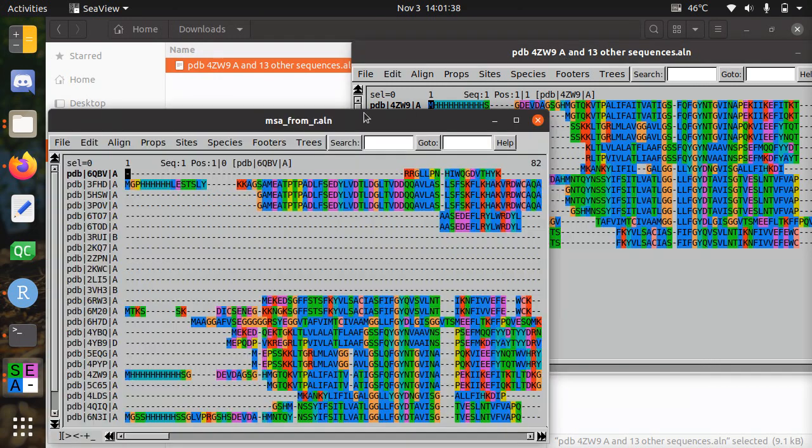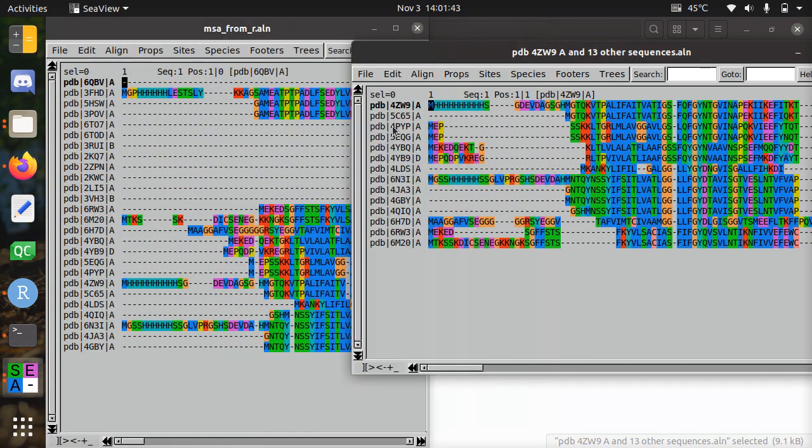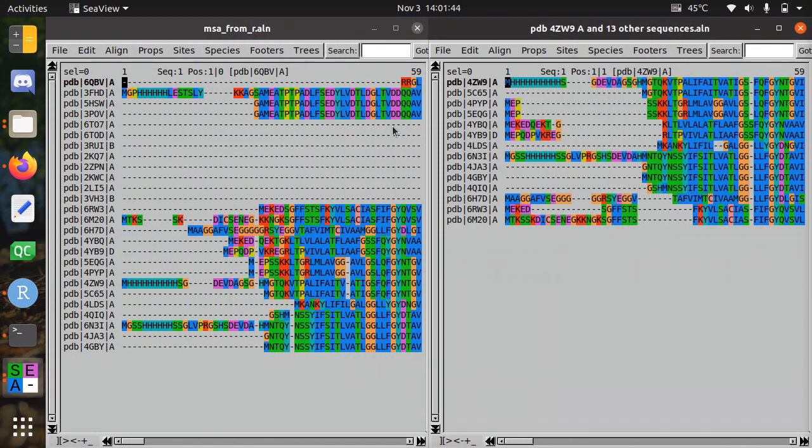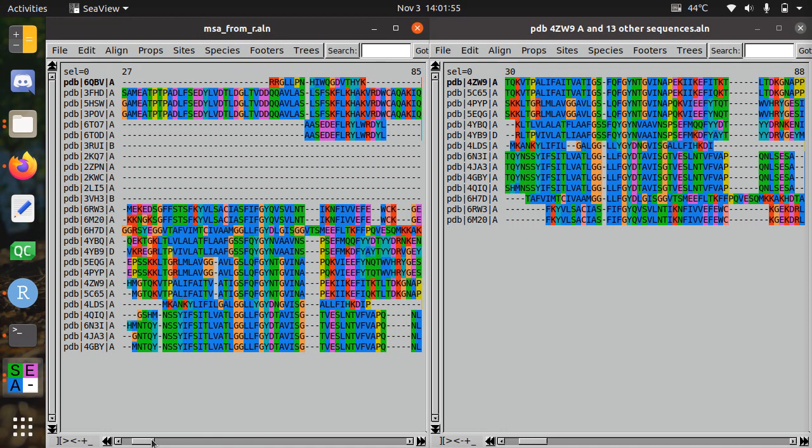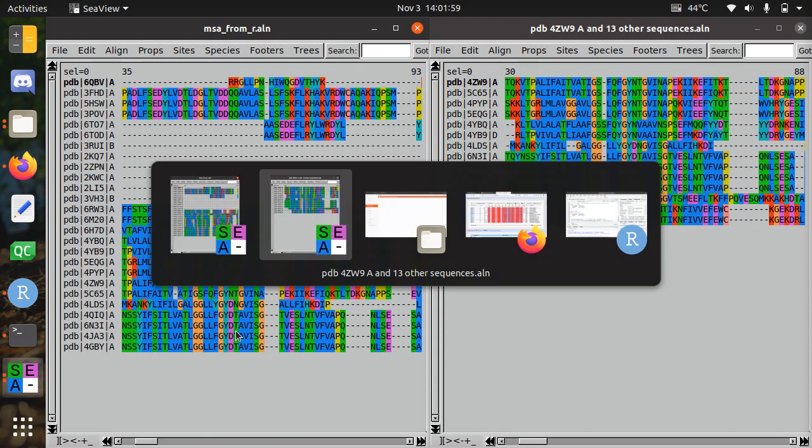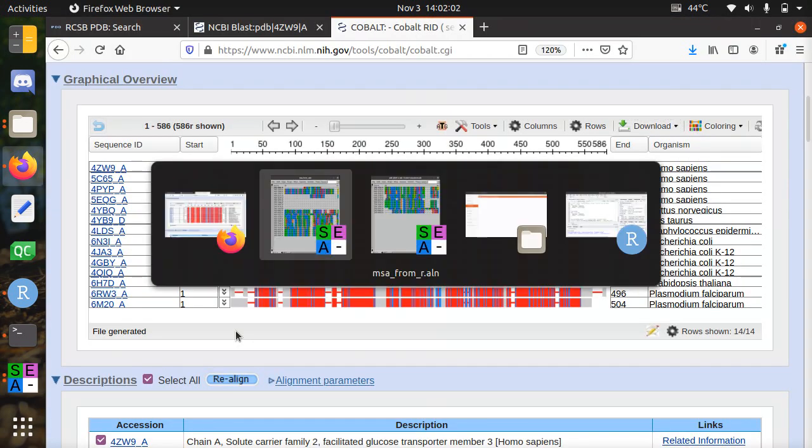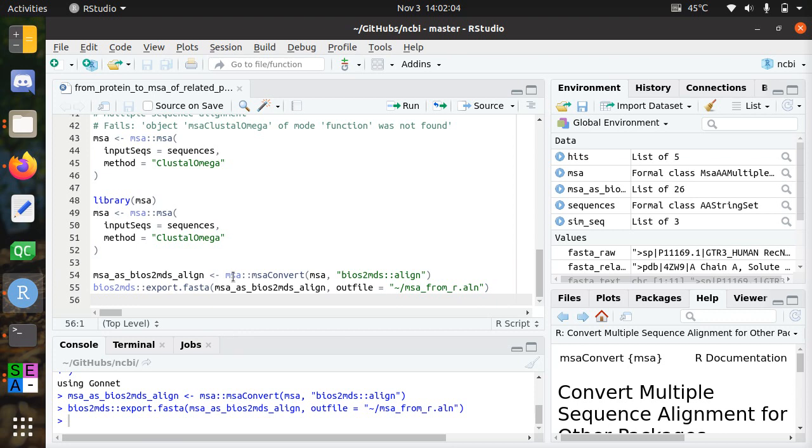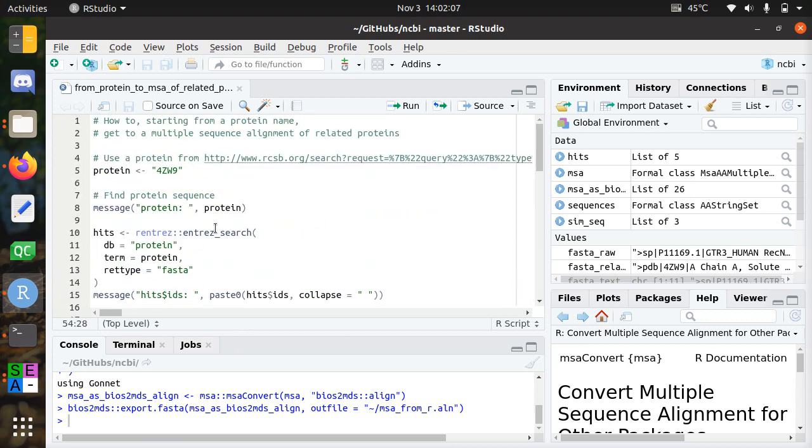So, if we compare those sequences. At the top I'll put the R sequence. At the left I'll put the R sequence. At the right, the NCBI alignment, you see that there are some differences. The number of proteins is different. The alignment looks different, but yeah, well that's to be expected from different proteins. This is how to do it quick. I'll now go into a bit more detail at what I did.